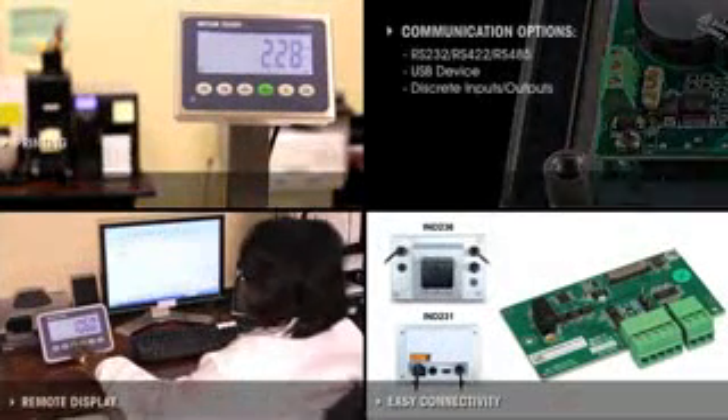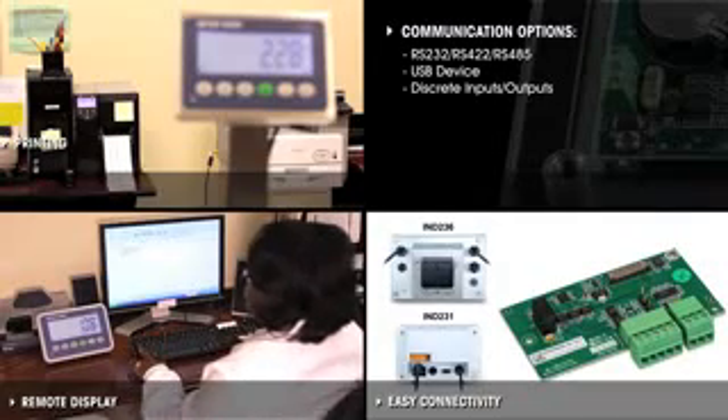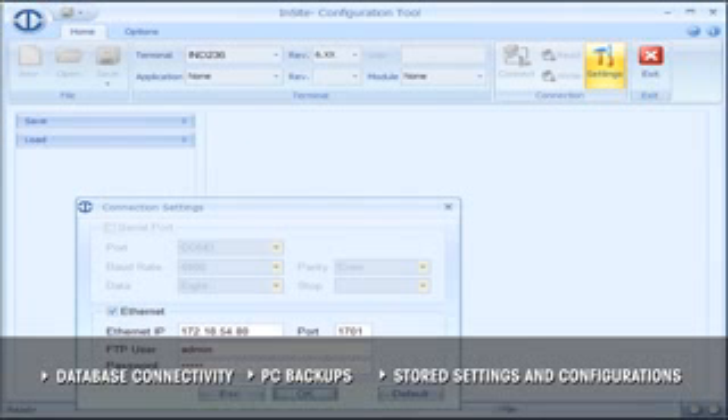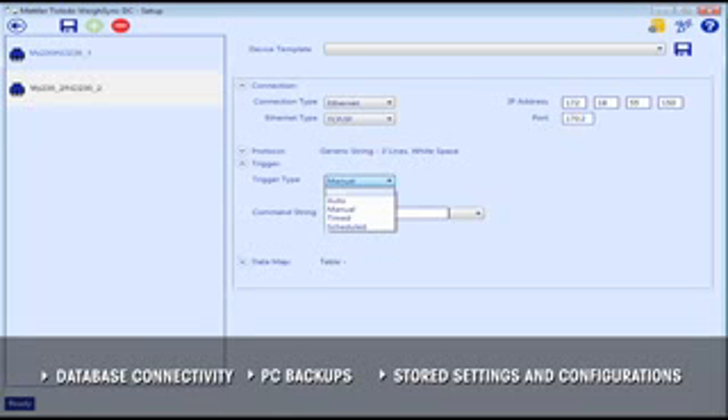The terminals add value with multiple communication options for today's modern workflows. Weighing data can be transmitted to production databases to improve efficiency. Free software enables users to back up terminal configurations to a PC and archive, restore, or duplicate settings and configurations to additional terminals.